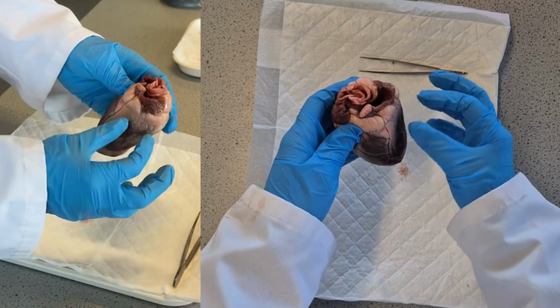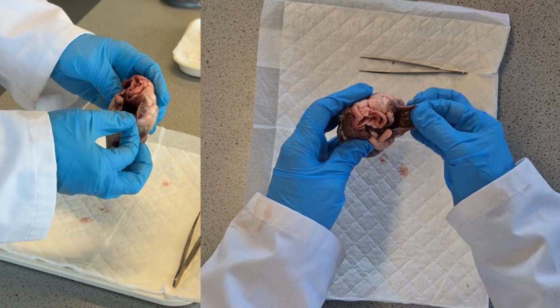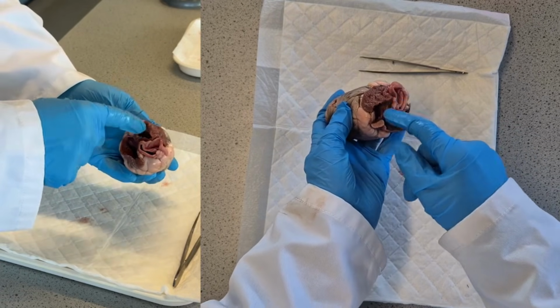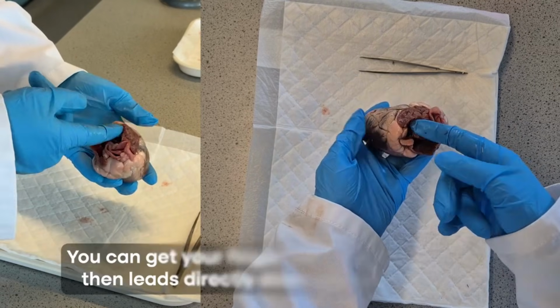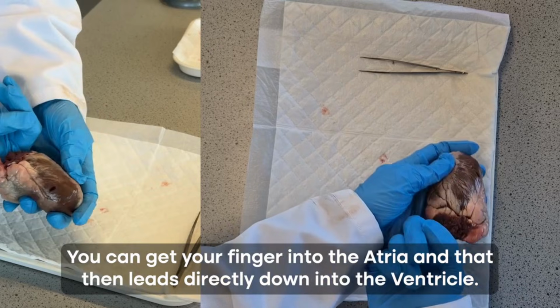We're then going to cut in so we can see the difference in the thickness of the ventricle cardiac walls, and so we can see some of the valves. Be warned if you are squeamish. One advantage of them actually already cutting into the atria, and actually you can cut into the atria to do this, is the way that I then check I'm going to be cutting in the right place is you can get your finger into the atria, and that then leads directly down into the ventricle.